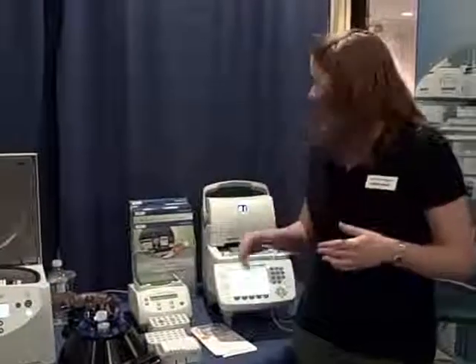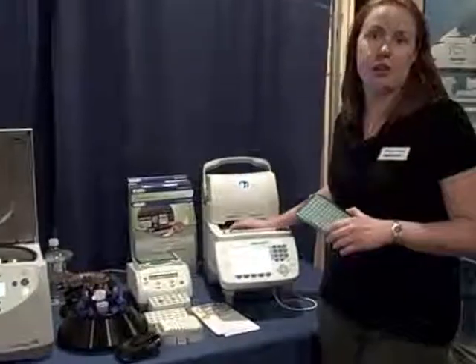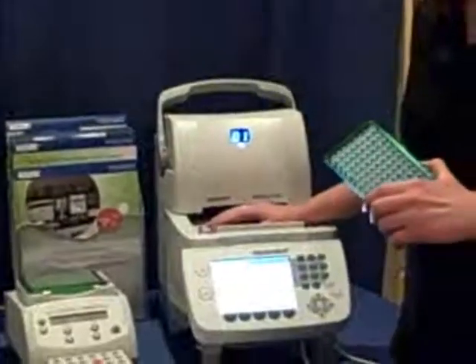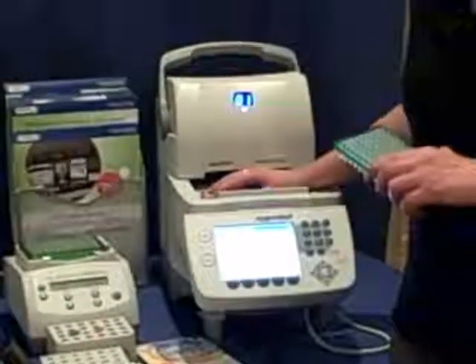It does all your gradient, touchdown, pretty much anything you want. We've got two kinds of blocks for it: a silver and an aluminum. With the silver block, it ramps at six degrees per second, so it's the fastest 96-well block on the market.